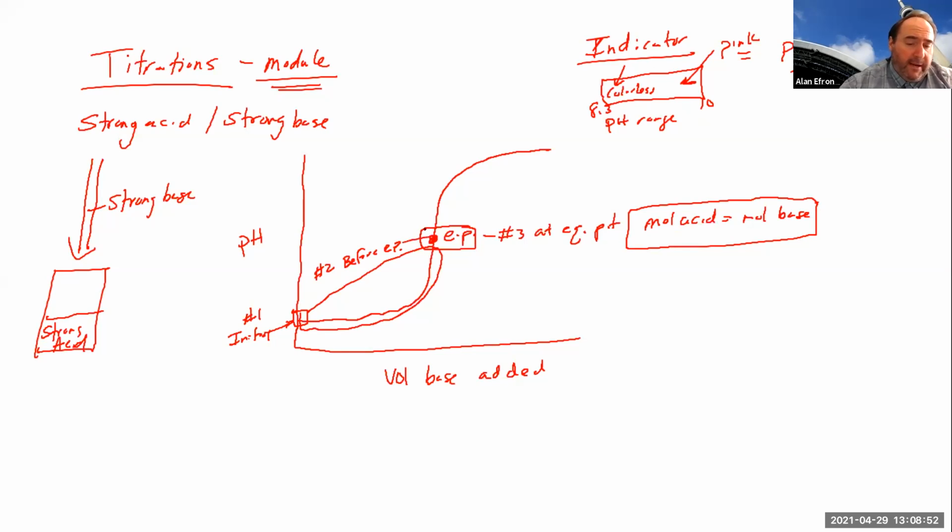When we go past the equivalence point in a normal titration, it's usually a bad thing, right? We usually don't want to continue past the equivalence point, but in this case we actually do, because that will allow us to get the complete titration curve. And that's the fourth point on all these titration curves, which is after the equivalence point.